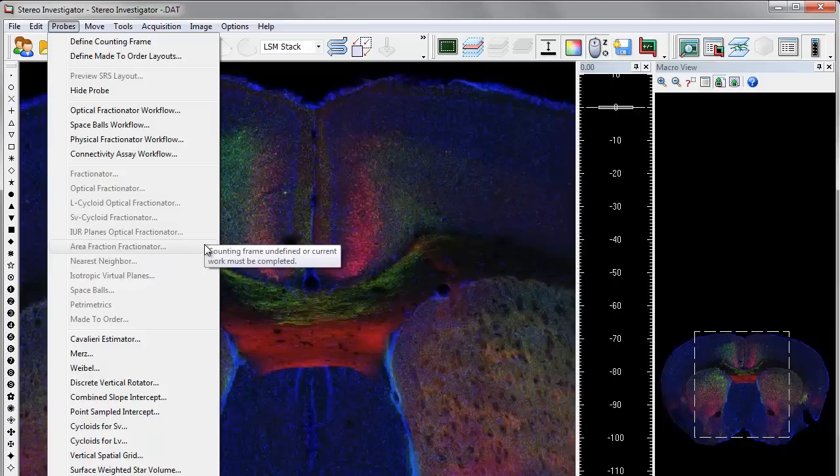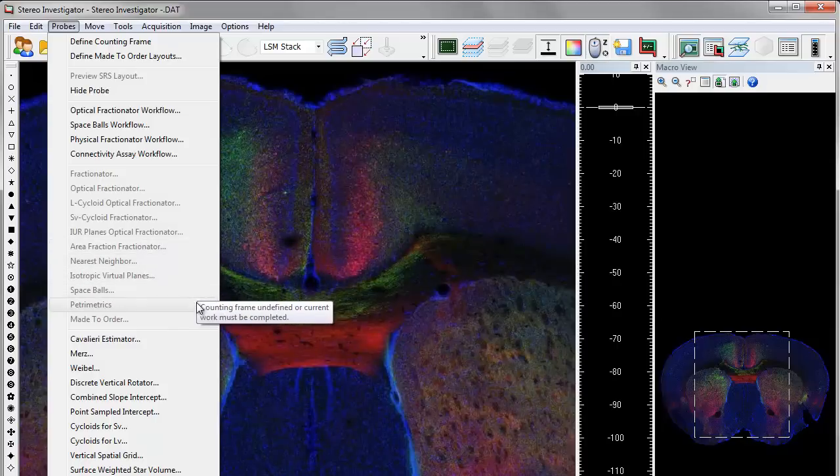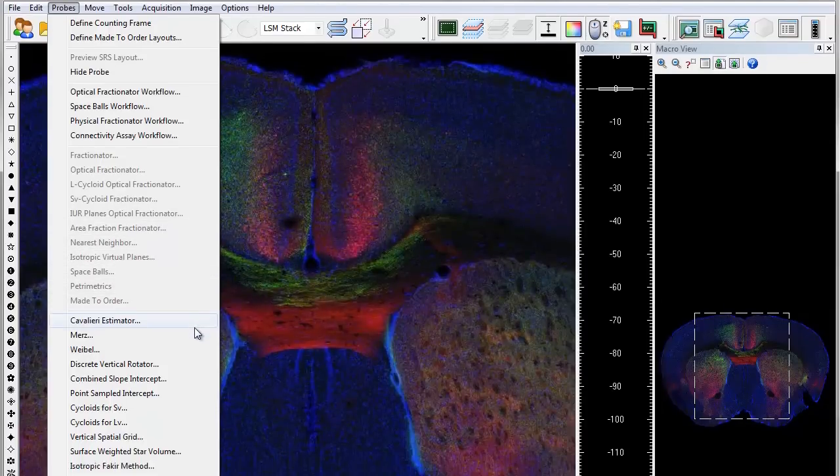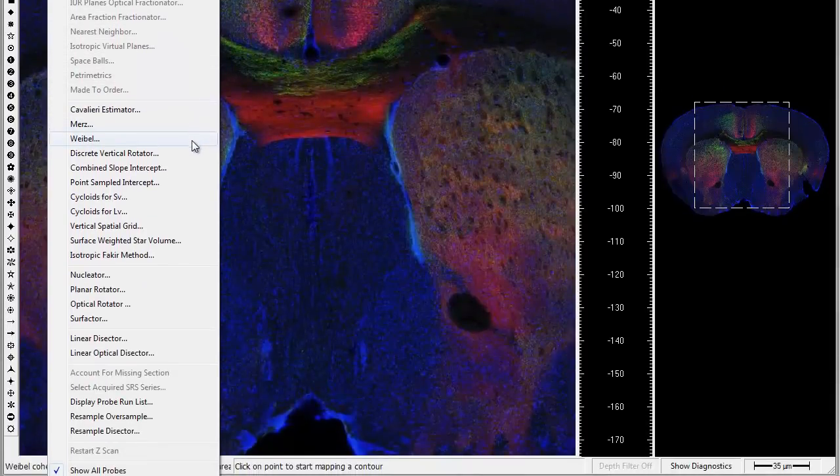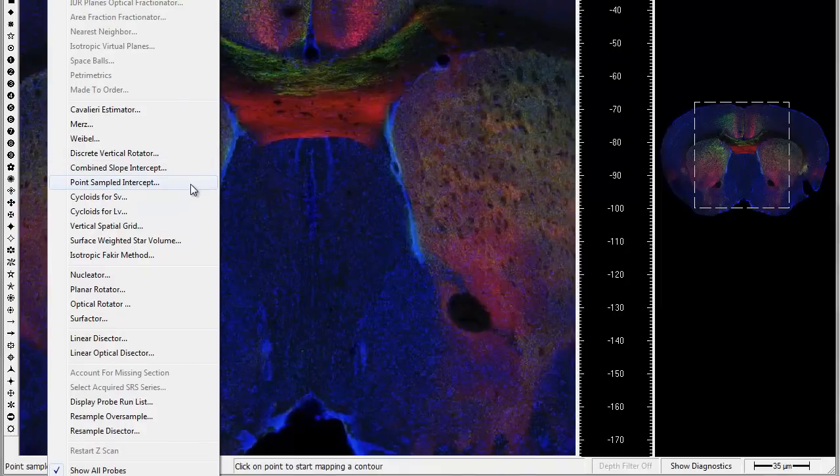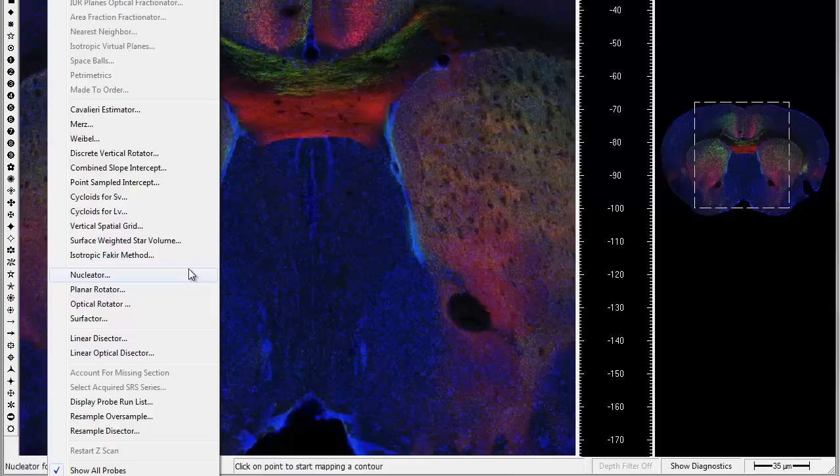Each probe in StereoInvestigator is made to accomplish a different stereological method efficiently and effectively. Many are even designed to work concurrently.